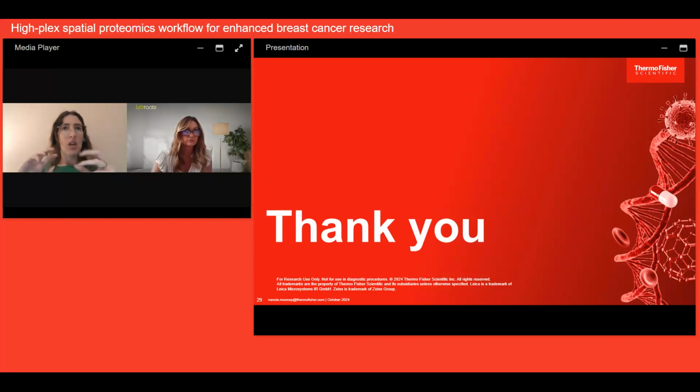So it has a combination of filter sets and LEDs that it uses in different combinations to basically take, this is the R&D scientist, not the spectral unmixing mathematician. So again, please find the other resources as well, but let me take a stab at this. So the EVOS S1000 is a spectral imager, which means that it's not just taking the single picture of the fluor of interest, it's also taking images in different parts of the spectrum to enable the unmixing of the spectral fluors. So it's taking like a full fingerprint, not just one image in each.